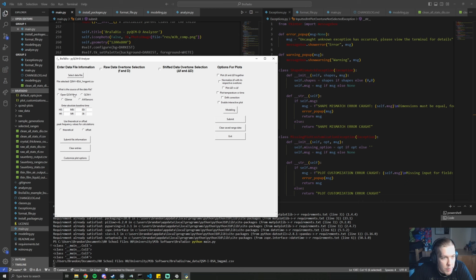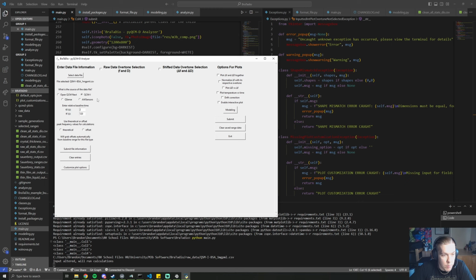These are the 4 types we support. There will be instructions in the supplemental information of the corresponding paper for the software that dictate how you can use different kinds of file formats that are outside of these 4 natively supported ones. There's a manual way and a way you can adjust the code, but for now we're just going to stick to showing you the supported formats.